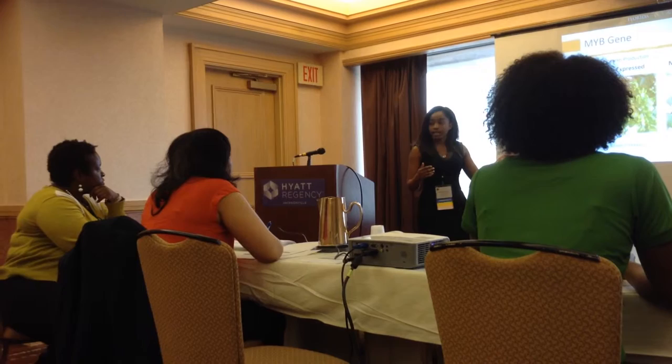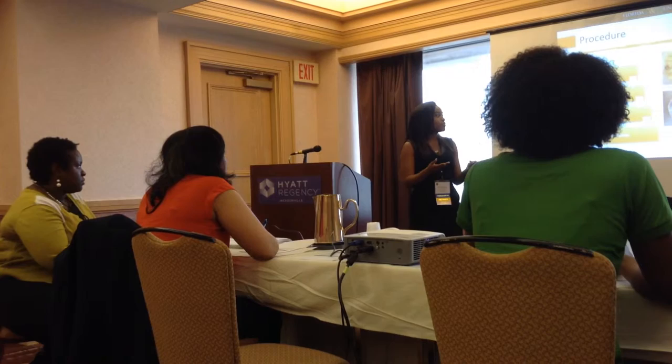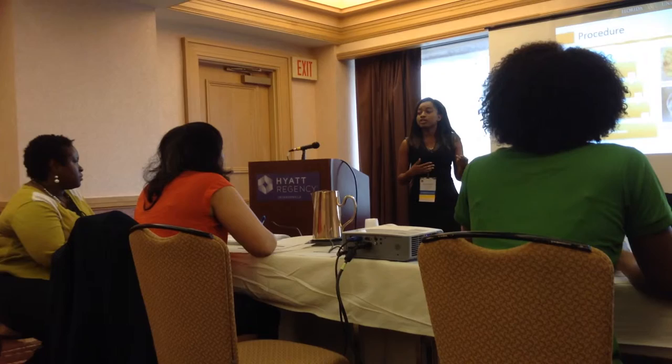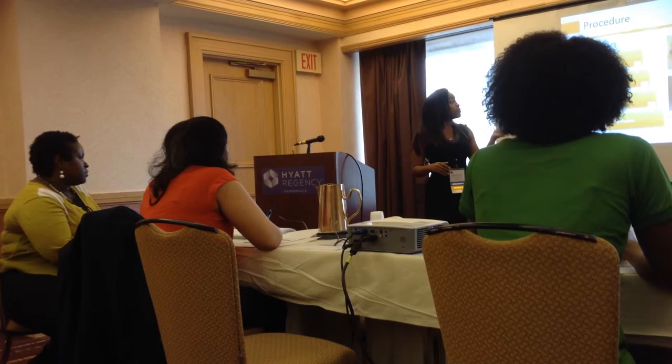In order to accomplish my goal, first I had to learn how to work with somatic embryos. Working in vitro is very difficult. You have to use aseptic technique. It's very easy to contaminate. So I spent about a year working on simply aseptic technique because these embryos were established in-house and they're not very easy to establish. Once I got my technique, however, I was able to prep my embryos for transformation.